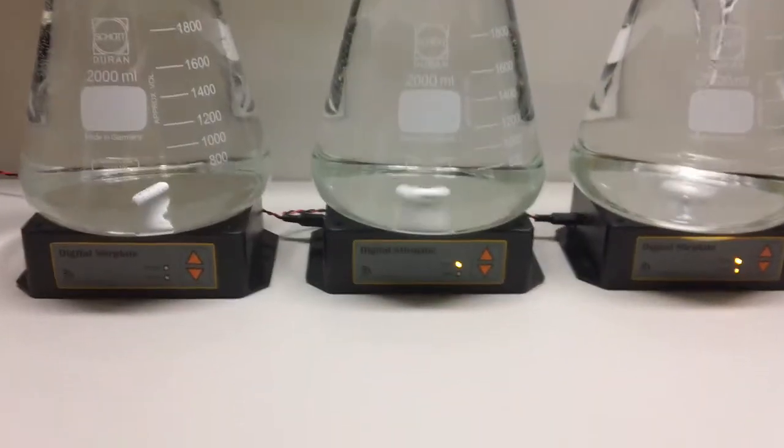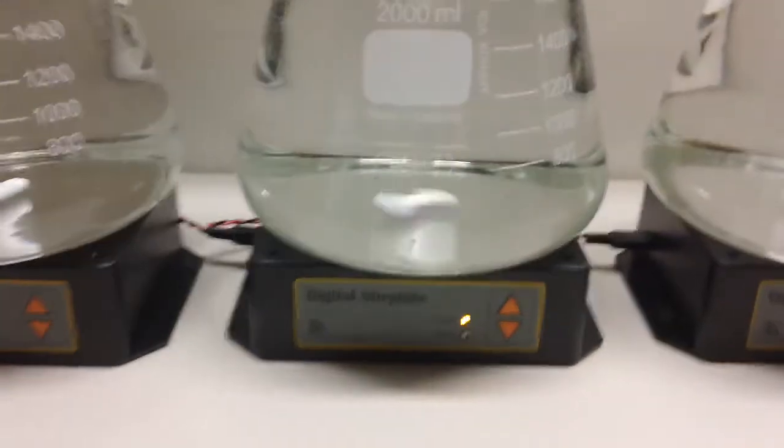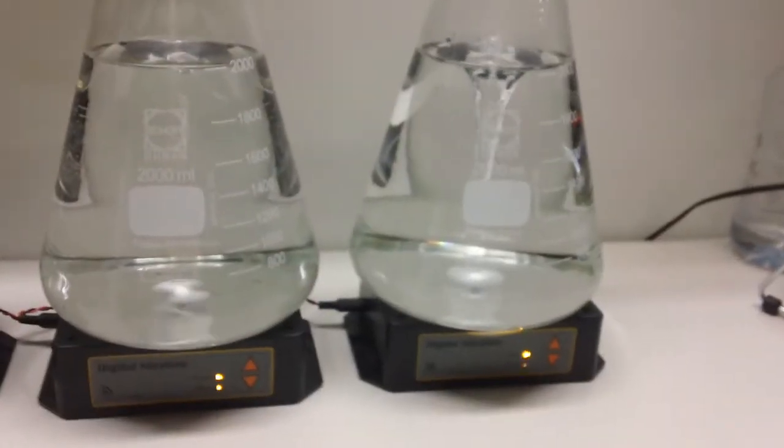To do this I've got three digital stir plates. One of them, the control, is not running at all. One's running at 500 RPM and this one's running at 1500 RPM which is a point where the vortex sometimes comes down and touches the bar.